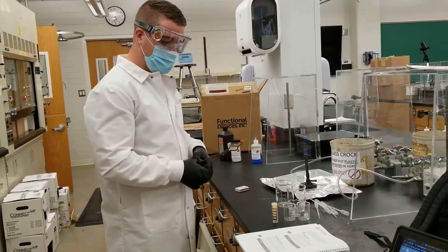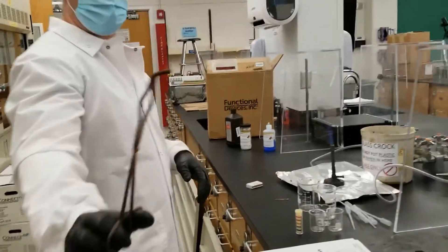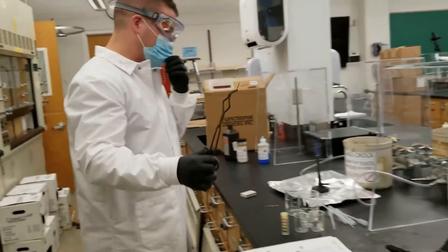We are doing test number one. We are burning a strip of magnesium, as you can see here. This is my magnesium and I'm going to light it on fire.